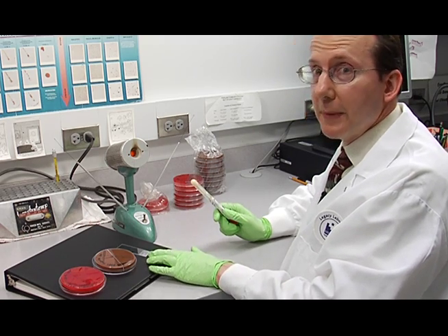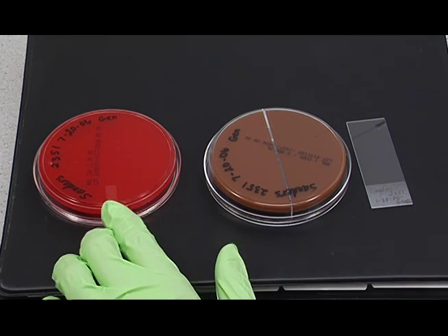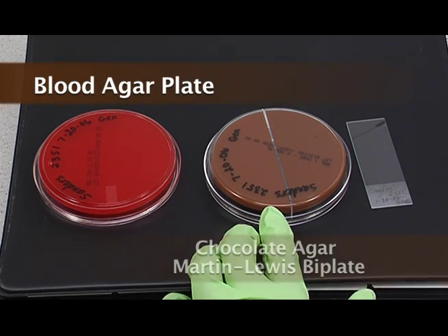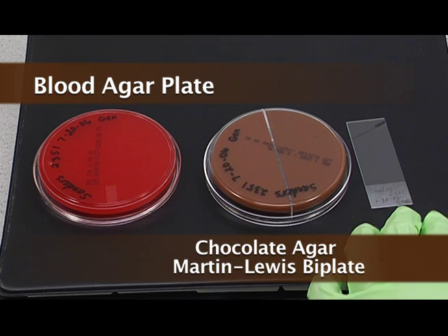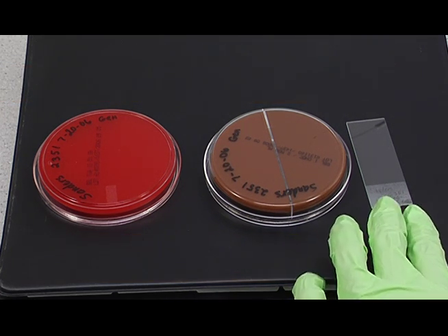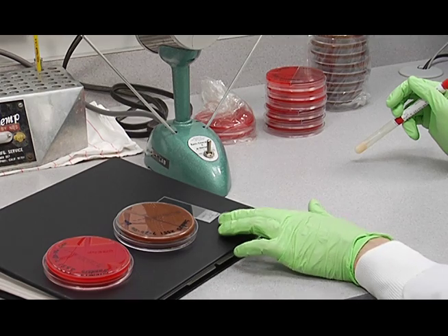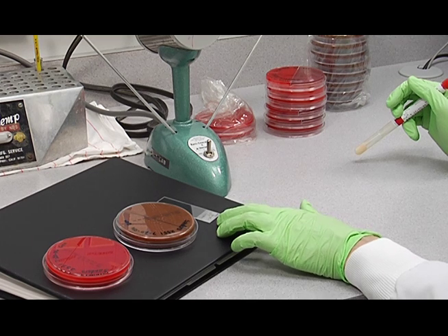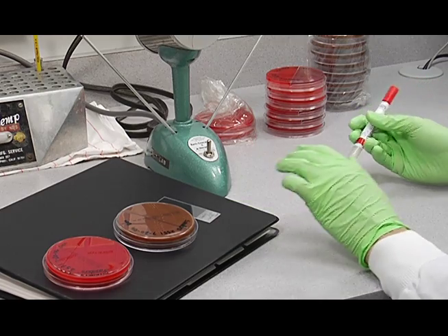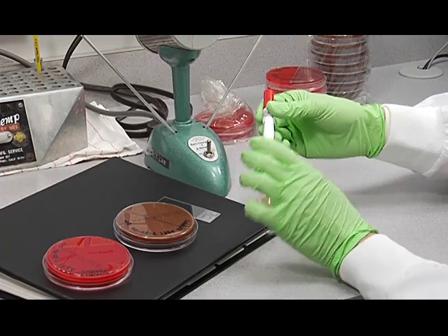We're going to set this female genital tract culture on a blood agar plate, a chocolate agar, and a Martin Lewis bi-plate, and we're going to make a smear on a slide. Make sure you've labeled the media, and make sure you label your slide with a pencil so that it doesn't wash off during the staining process. We're going to set this up from a genital swab.